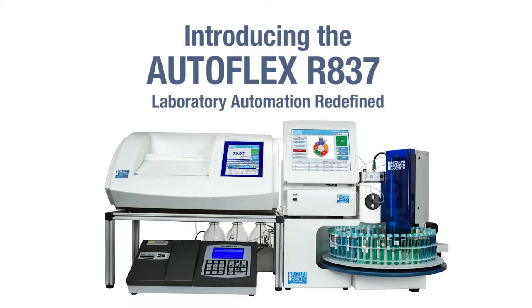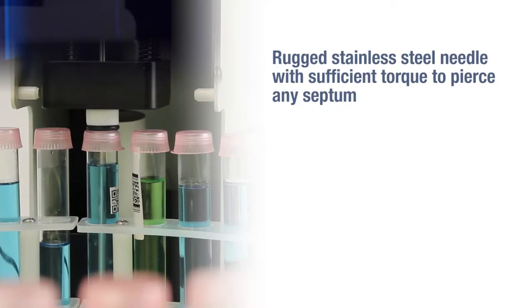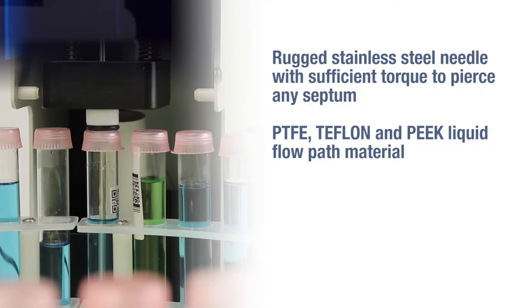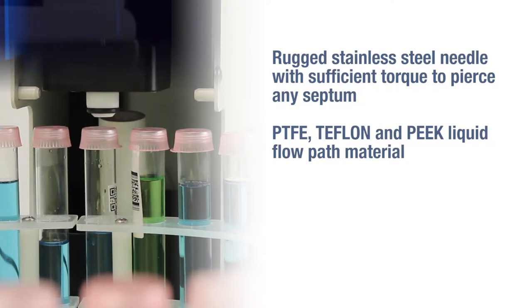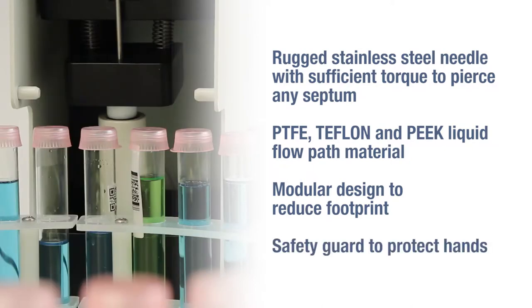Introducing the Autoflex R837 from Rudolph Research Analytical — Laboratory Automation Redefined. The Autoflex R837 features superior material construction and unmatched durability, including a rugged stainless steel needle with sufficient torque to pierce any septum. Liquid flow path materials include PTFE, Teflon, and PEEK. The modular design reduces footprint and includes a safety guard to protect hands.